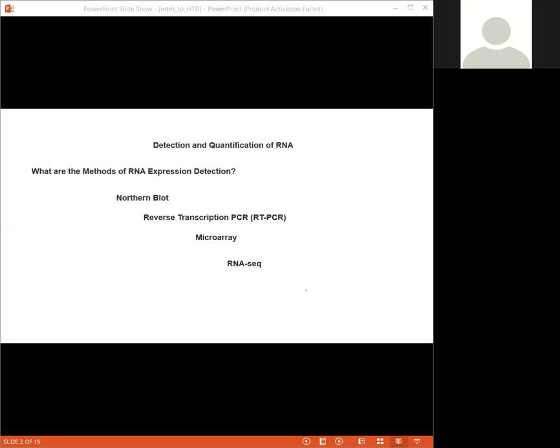Okay. I forget, but I think for the amplification we need 1 minute and another is 45 seconds. For each cycle. Okay. Each cycle, yes sir. So approx 1 minute or 1.5 minutes. So 30 cycles will require about 1 hour to 1.5 hours. Okay, it depends on the other parameters also, but you can finish it within 3 hours. So it's not a big deal with the RT-PCR technique.